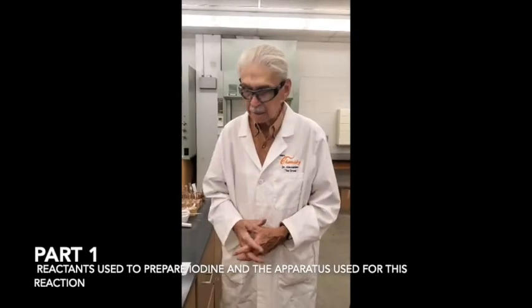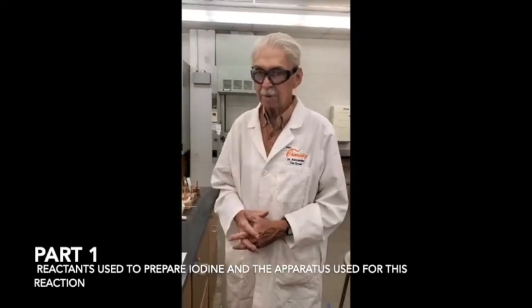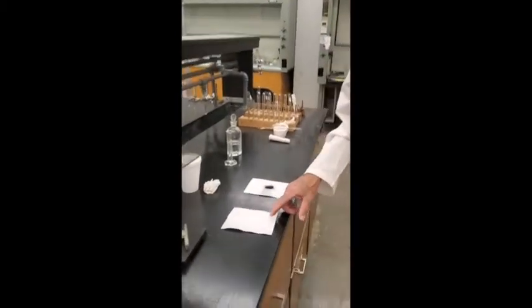Hello everybody, we're going to study iodine today. We did a little experiment last time on the halogens. We made iodine in solution, but now we're going to make pure iodine. We're going to do it by taking this compound right here, which is potassium iodide.